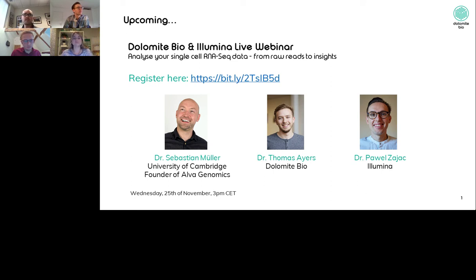So I can answer this probably on the statistical side. This is a question that I get asked regularly by many, many people. And it's not an easy question to address a lot of the time because it really needs an understanding of the underlying heterogeneity that you see within the sample, and specifically the smallest cell population that you want to measure. For instance, I do quite a lot of work on cancer, and some of the times you just don't get the numbers of cancer cells required to get enough statistical power. To work out statistical power, there are now quite a lot of very good single cell power calculations that you can do, for which you first of all generate pilot data, and then you can feed that data into the power calculations. I think maybe Tom might want to answer this in terms of the hardware.